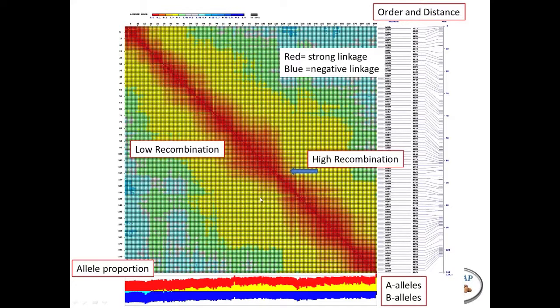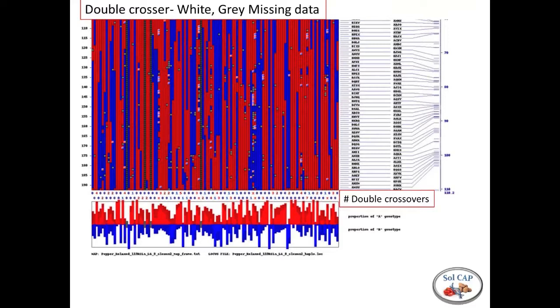And so this is one part of the graph. If you slide to the right, you see the next part of it, the graphical genotypes. You can pull these as single images or as images with the previous image. So here's your graphical genotype, which also shows your markers, their order, the genetic distance, and the allele frequency, just like before, in a different graphic.